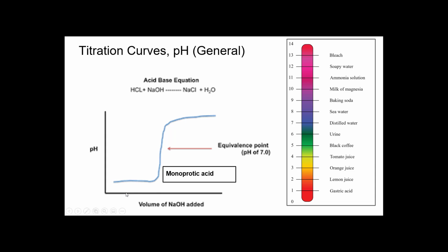As the sodium hydroxide is added, as you can see here with the volumes, the pH doesn't change, and then all of a sudden it's going to jump. And this is why some students don't like titration. Sometimes this huge jump is 1 drop. It depends on how patient you are. And I have found that a lot of my students are not very patient, so they go past this.